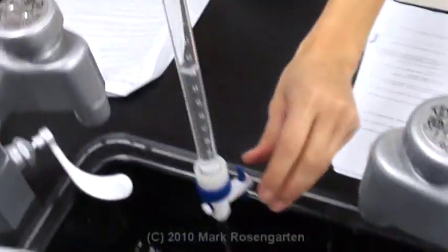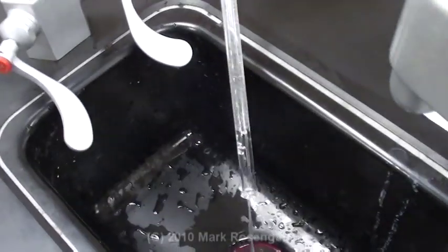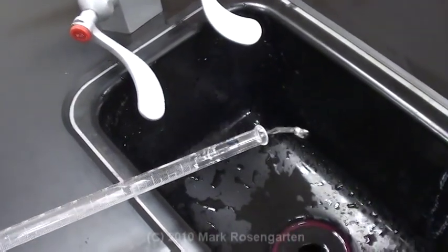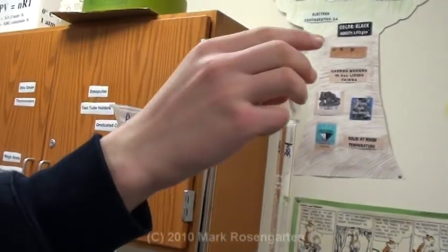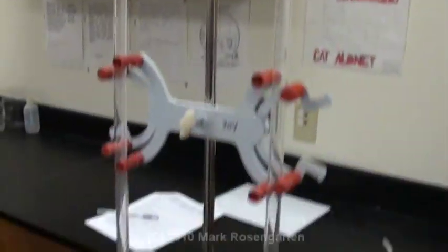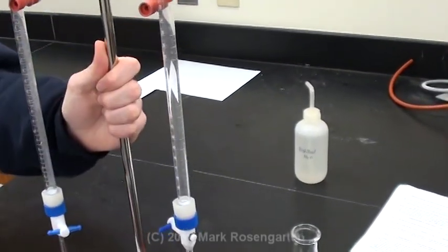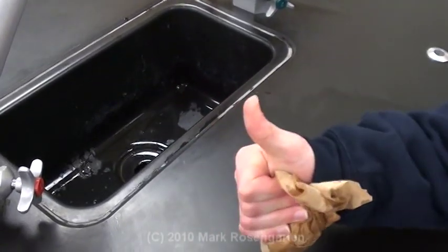And now close the valve on both burettes and then turn them upside down and dump out the distilled water. Repeat the process with the other burette. Reinsert the funnels once both burettes have been cleaned, and then place all equipment back along the side of the room where you found it. Perfect.